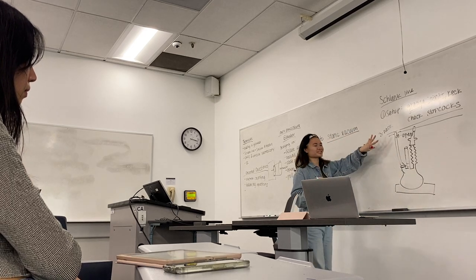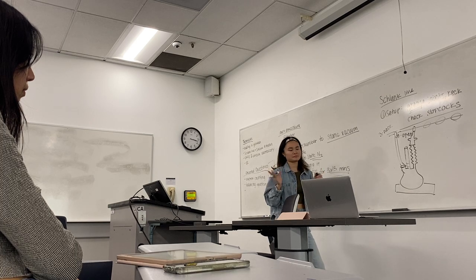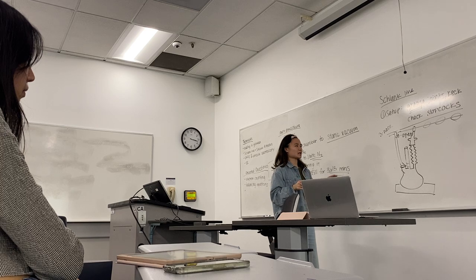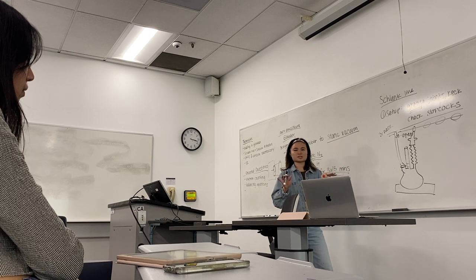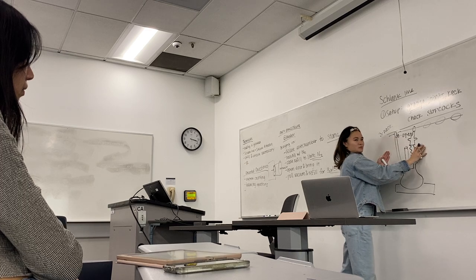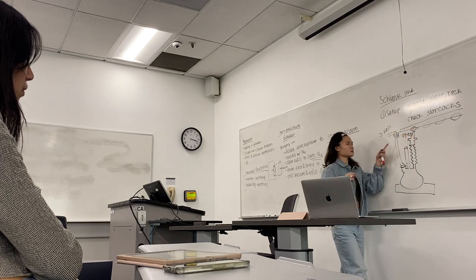Okay, so this is a Schlenk line. The biggest thing, I feel like mistakes in labs in general and from previously teaching this class, is that you always examine where the stopcocks are open and where they're closed, right? So let's say you are just doing these reactions with the 3 neck flasks. Let's say these are closed for the minute.